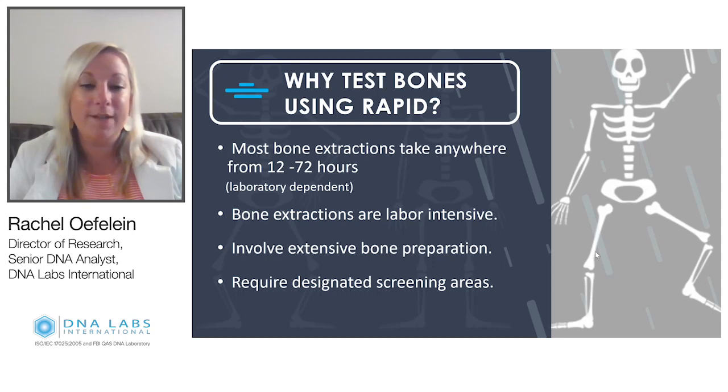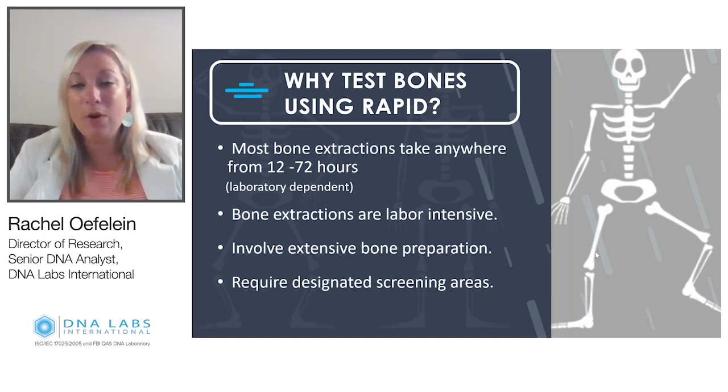Bone extractions are incredibly labor intensive and they require special equipment and training for handling them. It also requires a designated screening area. You wouldn't want to be screening bones right next to where you have high quality samples. At our laboratory, our high quality and low quality bones are separated as well so that they're not being done in the same area. So that goes for all the equipment that's used for screening them too.